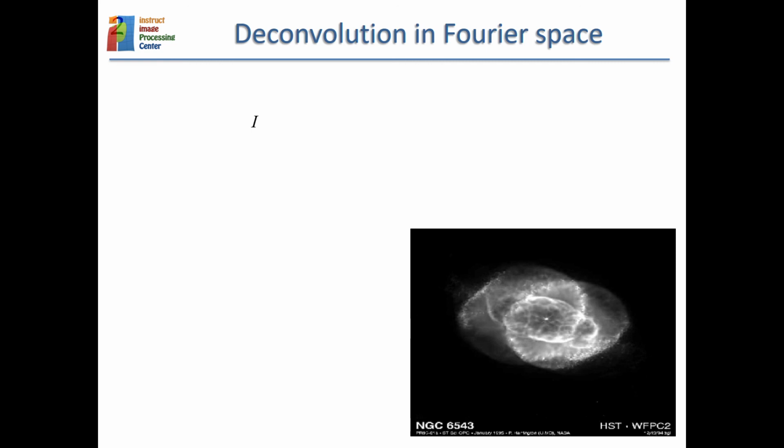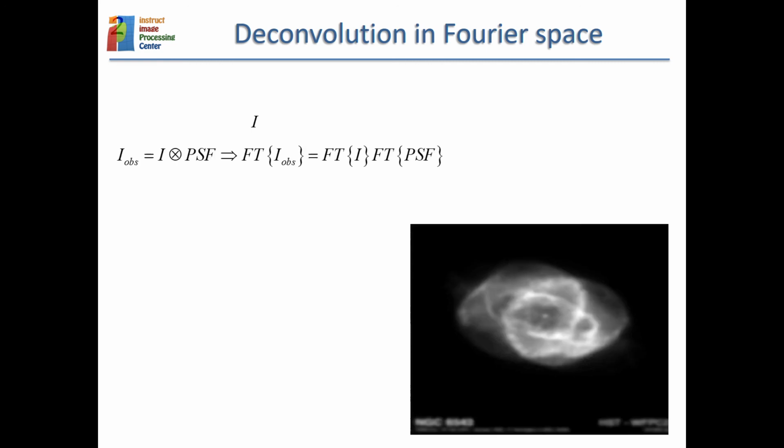So the microscope is convolving, but you can define operations in the Fourier domain that are aimed to restore the aberrations of the microscope. So let's say that we have this ideal image, but we cannot have access to the ideal image, but in a very simplified way, the image that we have is that one convolved with a PSF.